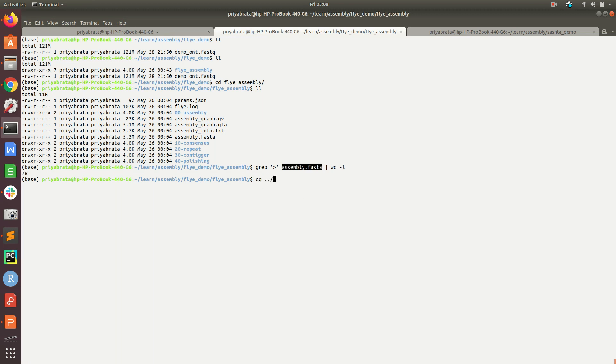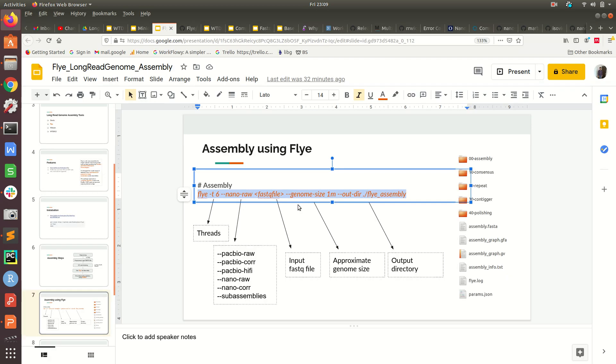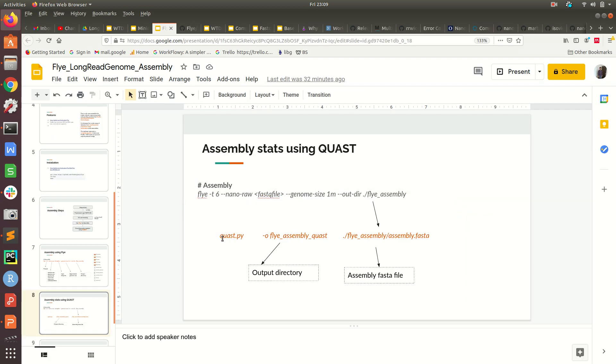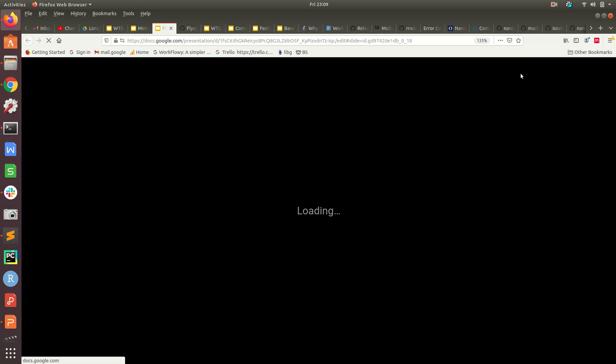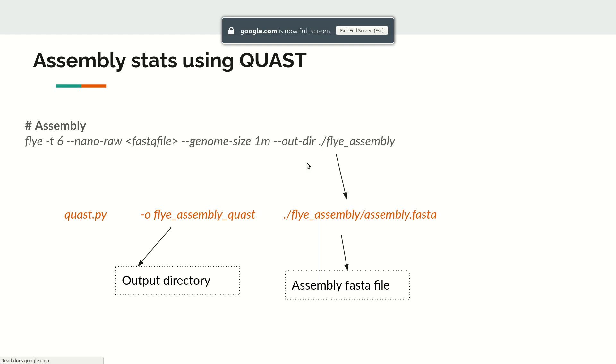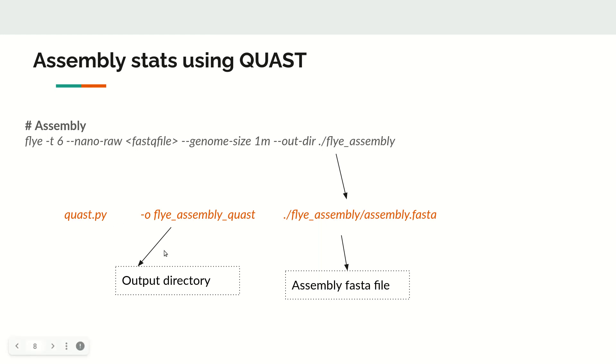In the next step, we will be using QUAST. In this QUAST command, we have to give the output folder where the QUAST results will be dumped, and then we have to give the input FASTA file which is in the flye_assembly folder.